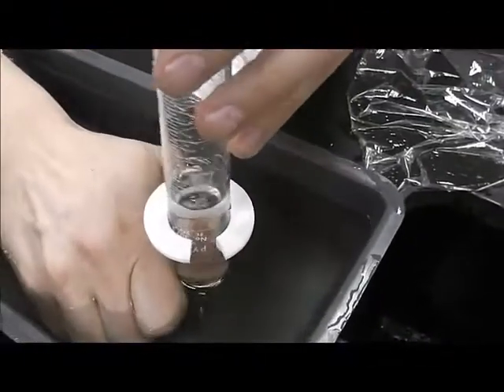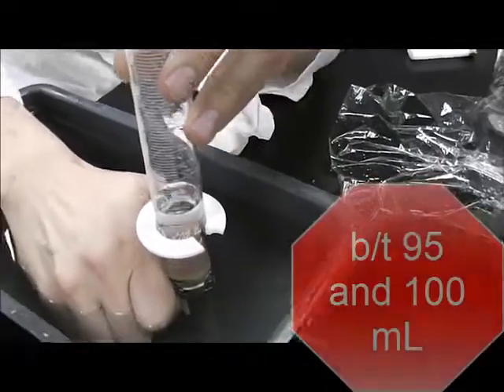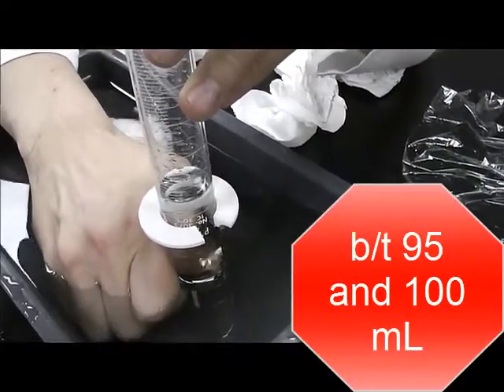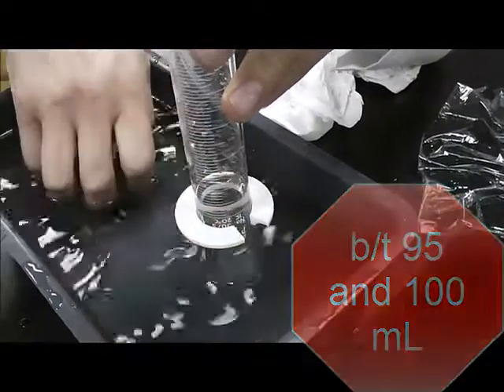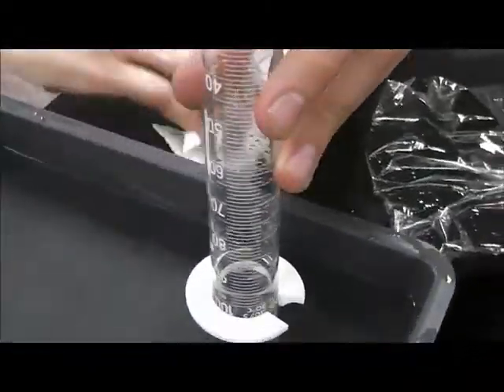Getting close to 95. As it gets closer to 95, you want to pay attention, because as soon as it passes 95, you basically want to stop. And I think I just passed 95 there, so I'm going to stop there. I'm going to take my butane lighter and set it aside.